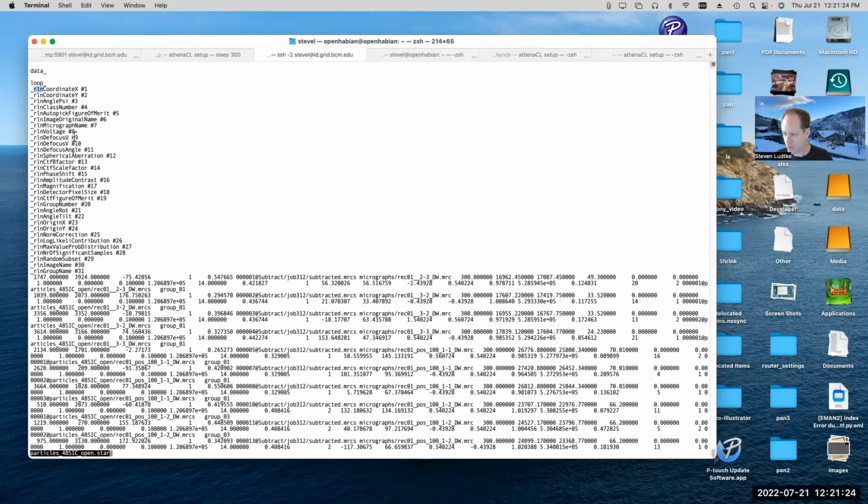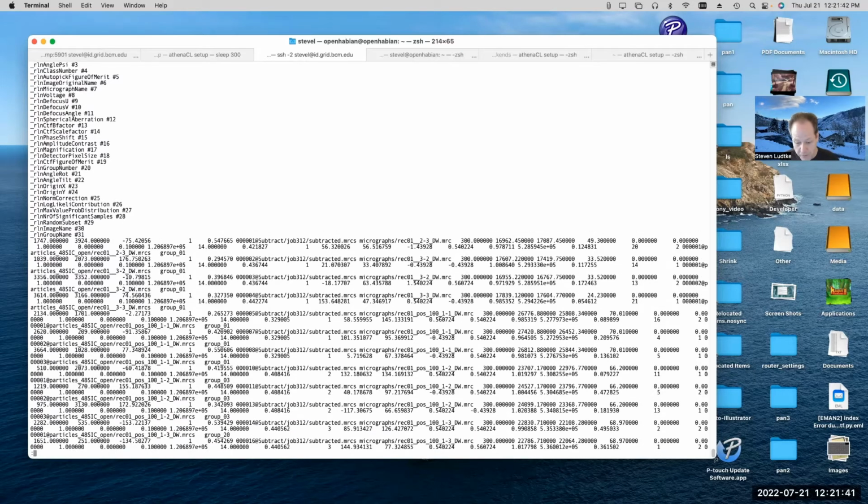Modern Relion files will actually take some of the common parameters like the microscope voltage and some of that stuff, and they'll make a separate loop up at the top to contain that information, and then they can have fewer columns in the rest of the data, which makes the file substantially smaller. Anyway, so this is how Relion stores its metadata. Each particle is on one line, and each line basically has all the information that you might need to do your reconstruction and figure out all the parameters of the particle.